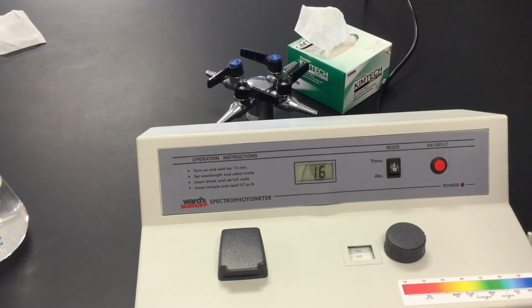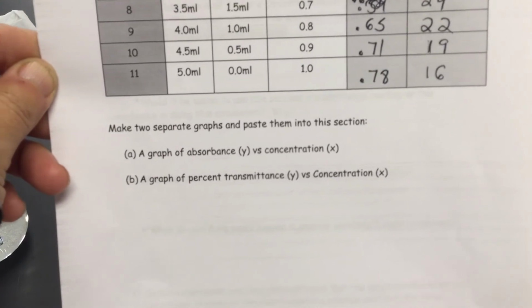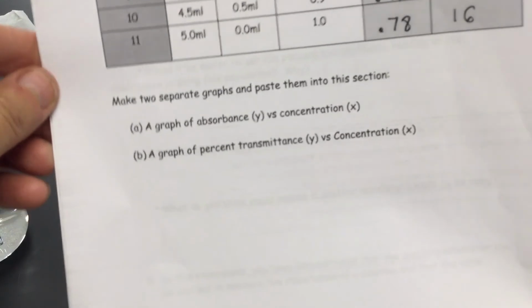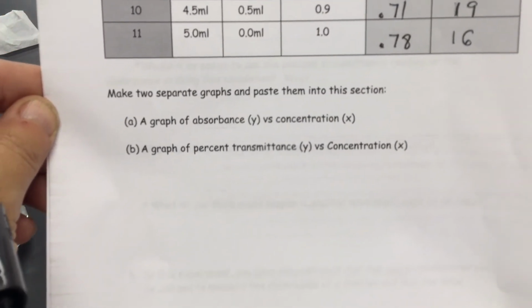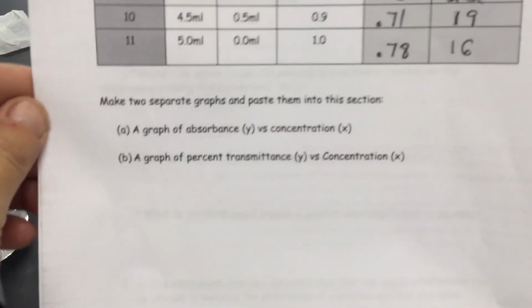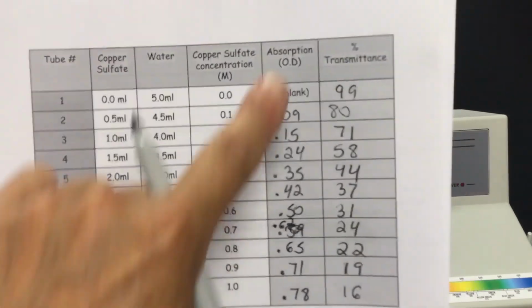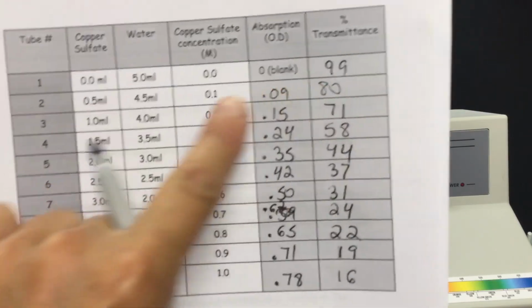Okay, so with this particular section now, with all 11 tubes, you guys are going to go through and analyze some data. So it says make 2 separate graphs, paste them into this section. Once again, go to Google Sheets or get some graph paper from me. Please do not use that lined notebook paper, and make your own scales along the way. Graph A, you're going to do absorbance versus concentration. I tell you what's on the X and what's on the Y axis. Make sure you give them a good title. Graph B, percent transmittance versus concentration. So here's my concentration, there's my absorption, there's my transmittance. So you're doing this versus this, and this versus this.